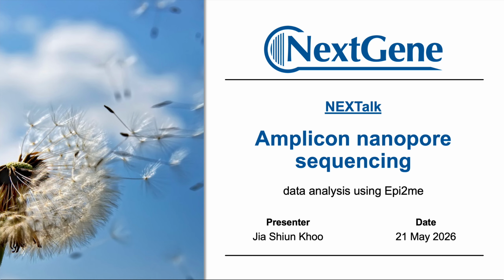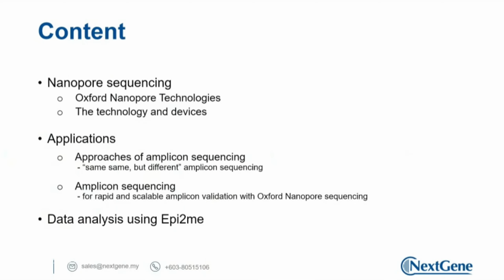The slides today will be about Amplicon sequencing. During this session, we will go through more about the applications of Amplicon sequencing. But before we talk about Amplicon sequencing, we will look into some background on nanopore sequencing. If you joined our session last week, you can skip the first 10 minutes, because we are going to recap the information about Oxford Nanopore Technologies, how the technology works, the devices, etc.